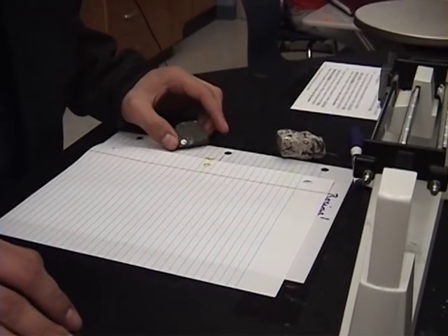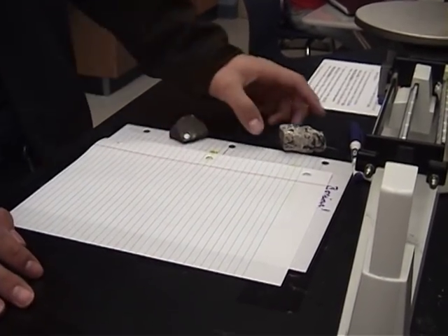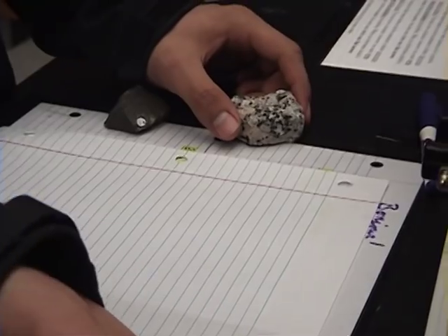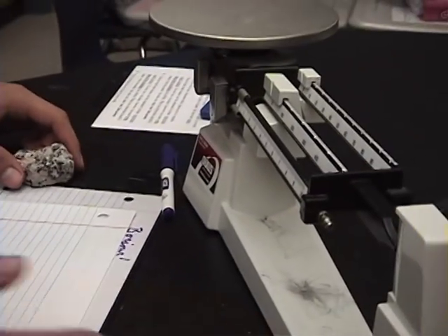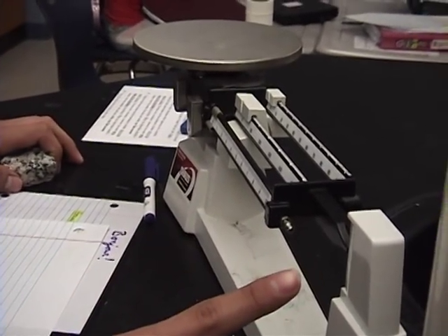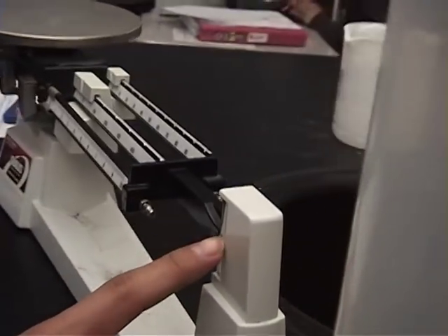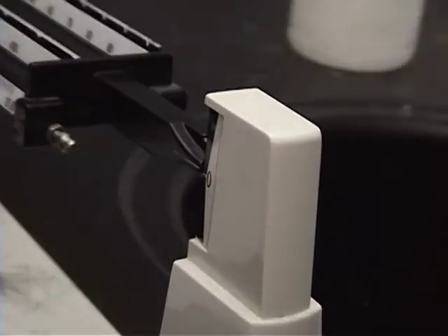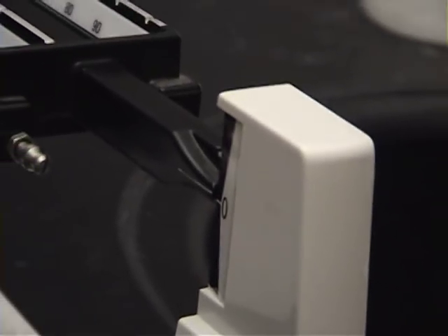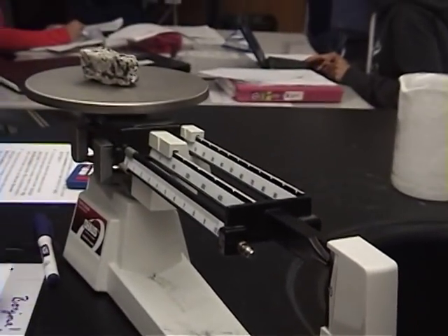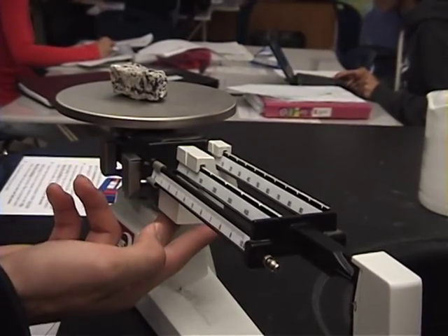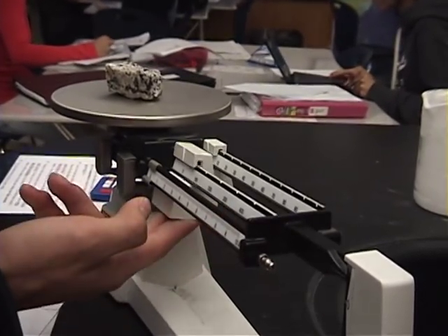So first we have to find the mass, which we have to use this triple beam balance right here. You have to make sure it's zeroed so that it's not too high or too low below the line. Let's go ahead and put the granite there, and then use this to figure out how much it weighs.